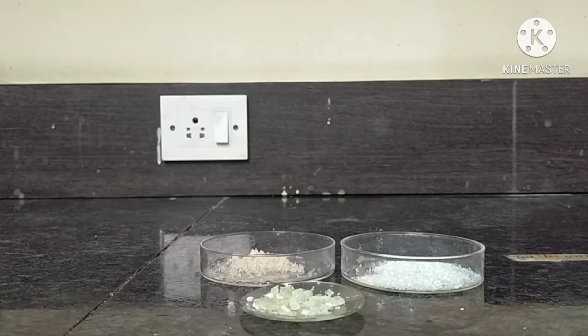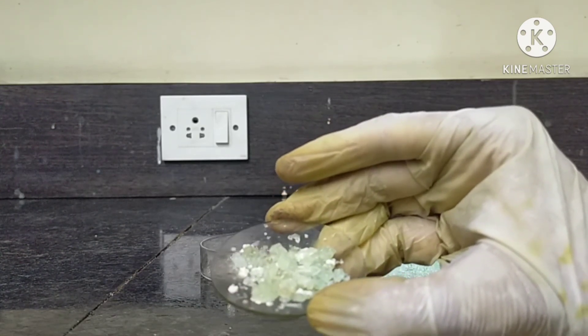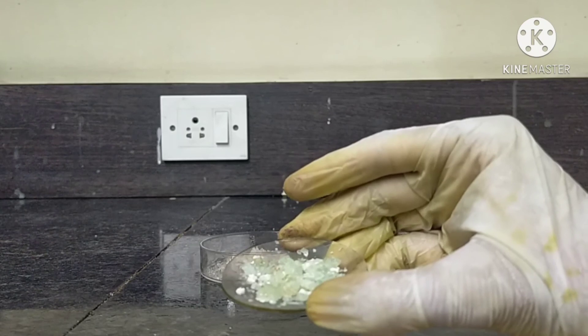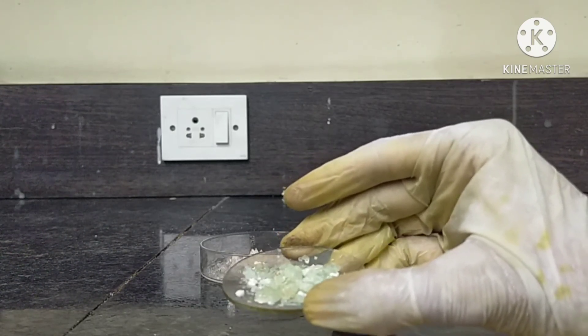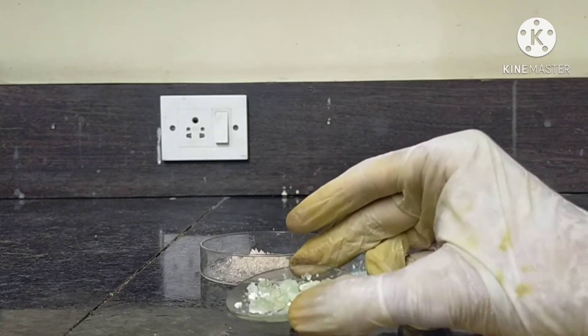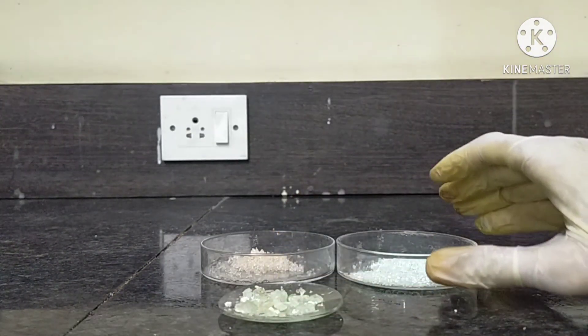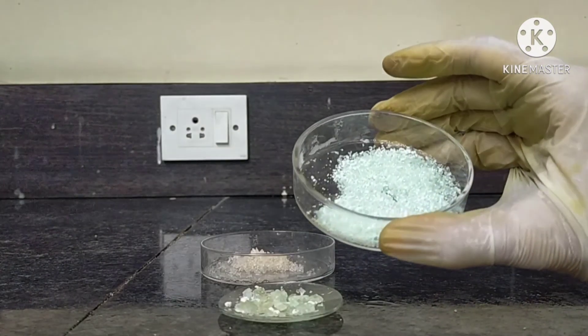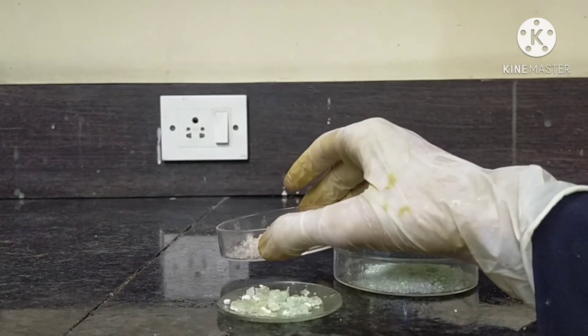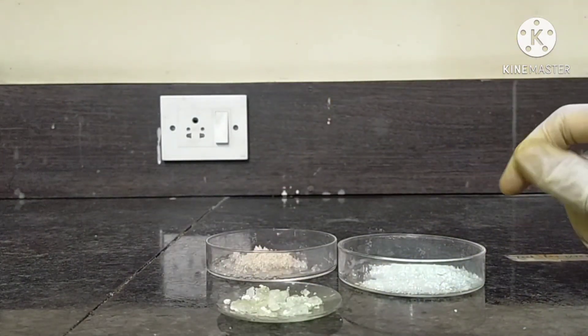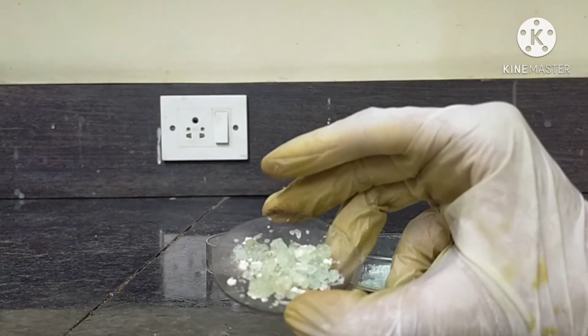So the theory behind this experiment is: First, this is ferrous ammonium sulphate or called Mohr salt. Mohr salt is one of the important laboratory reagents and is used as a reducing agent. Chemically, Mohr salt is ferrous ammonium salt or called a double salt. It is prepared by dissolving an equimolar mixture of ferrous sulphate and ammonium sulphate in acidified water. The ferrous ammonium sulphate color is faint green color solid.